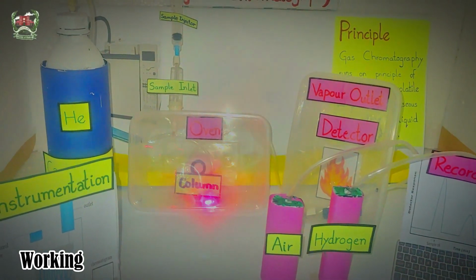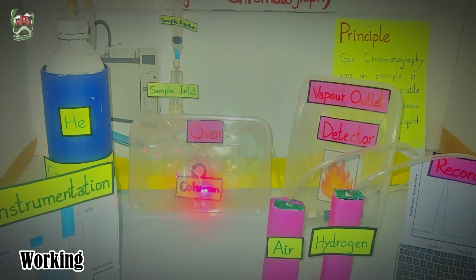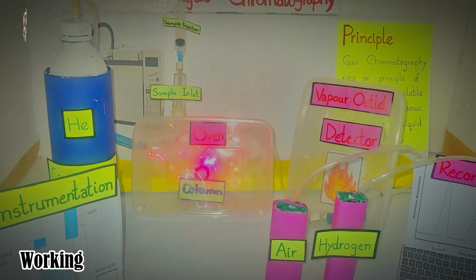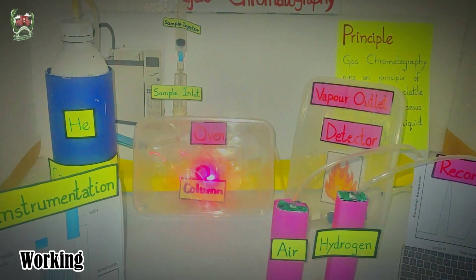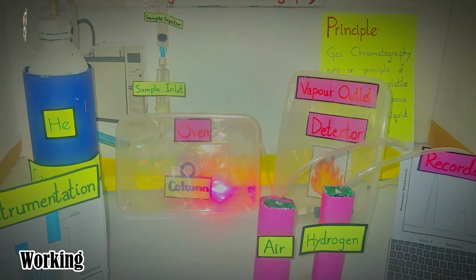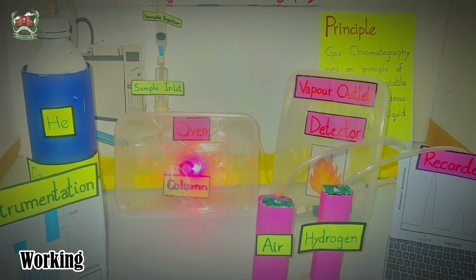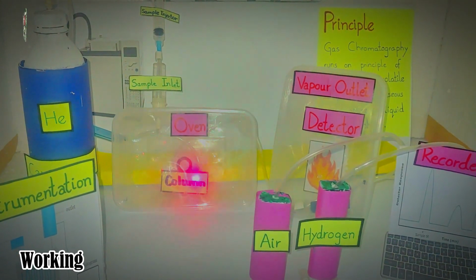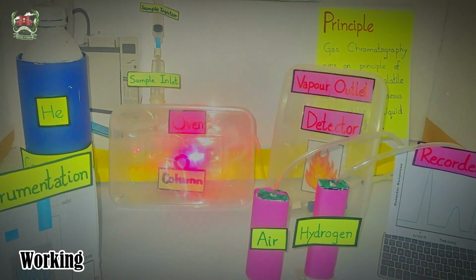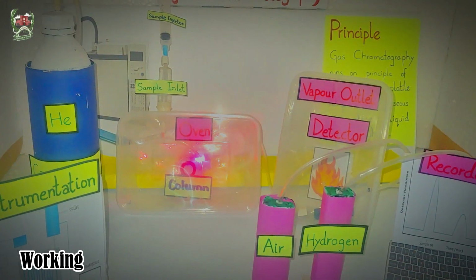When the vaporized sample or the gaseous sample enters into the column, separation starts according to the boiling point and the size of the molecule. Low boiling point compounds and smaller size molecules will show higher affinity with the mobile phase and probably elute out faster, as compared to high boiling point compounds and large size molecules, which will probably elute out later. But some compounds having very high boiling point are not eluted in the normal condition. In that case we can increase the temperature of the oven and increase the elution rate. So this gradual increment in the temperature is called temperature programming.